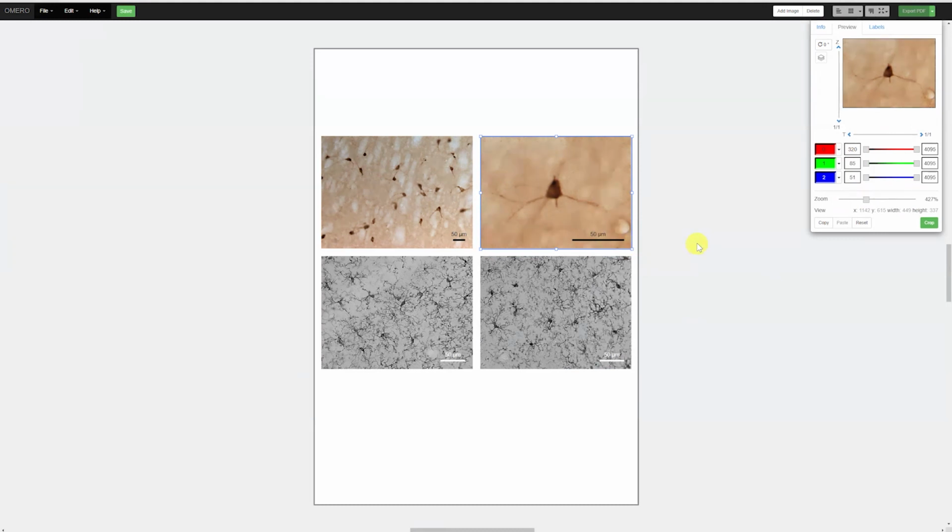You can also do things with labels that include information from the key value pairs or other metadata, so that you can have cell lines, treatment groups, things like that, that show up as column and row headings and such. You can save this, and again, the underlying data is not changed. I didn't crop this image. I just zoomed it in for this particular function. And you can also export it so that you can go straight to your publication.